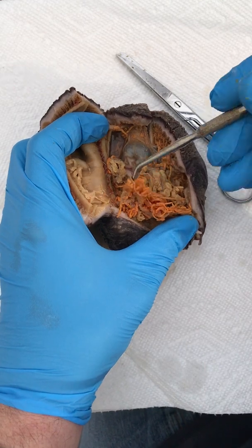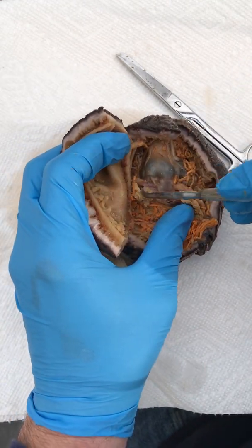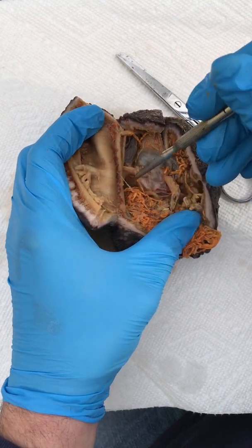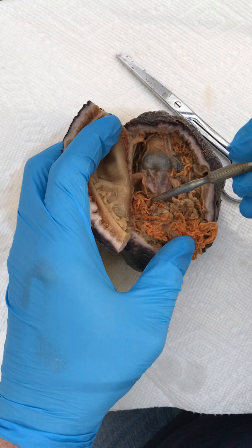This area here is all gonads with the bright orange coloration, and there are a series of those pharynx retractor muscles. If I move some of the intestine away here, you can see it's densely packed and wound up inside the cavity. Here's another muscle attached to the pharynx — again a pharynx retractor muscle.